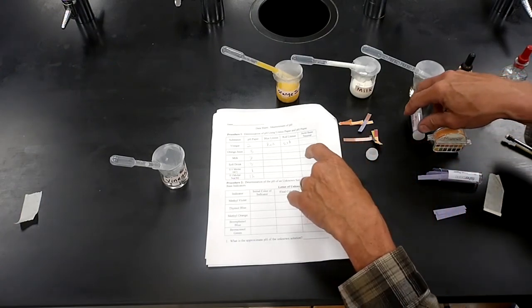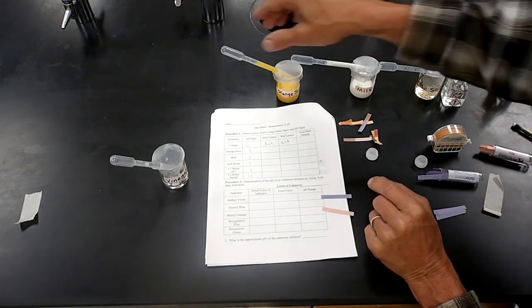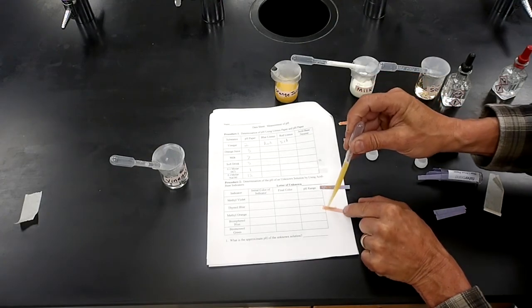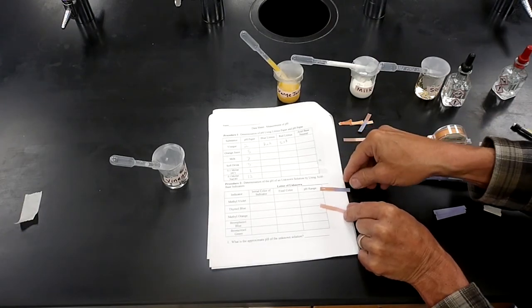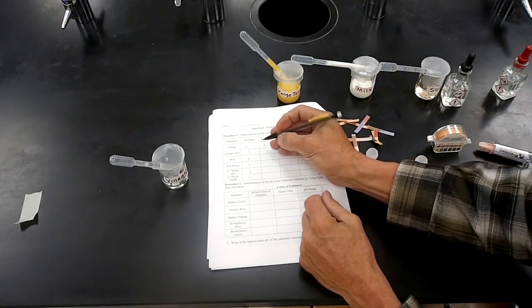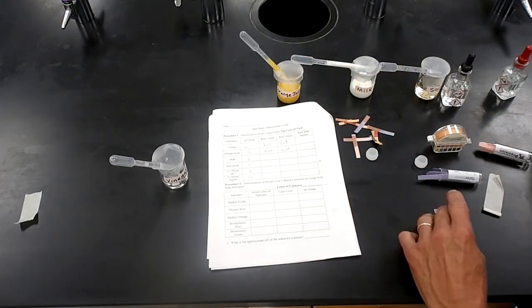Next one. We'll do the orange juice, blue litmus, red litmus, red and red. So for orange juice, the blue went red, and the red stayed red. Next one.